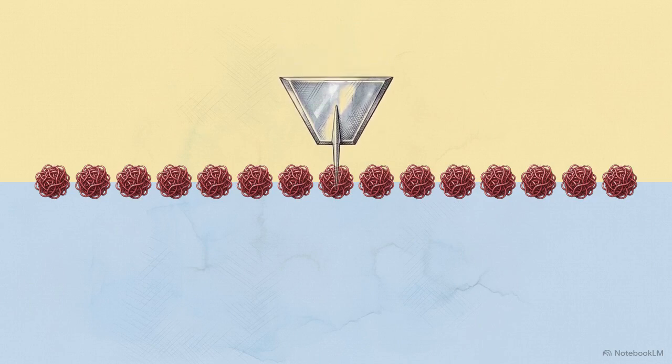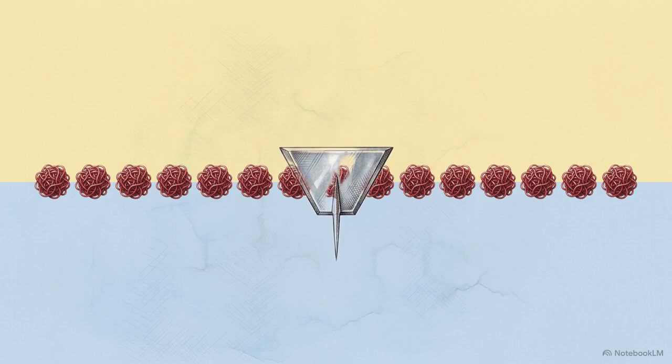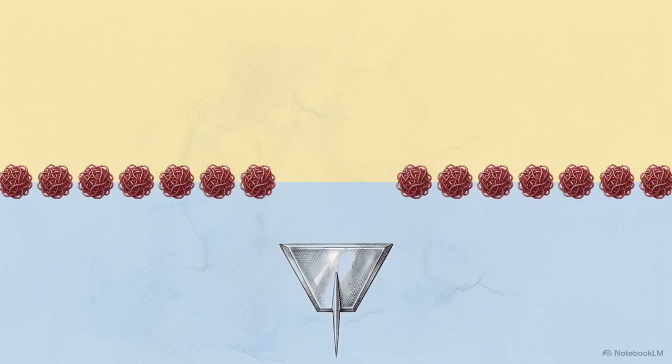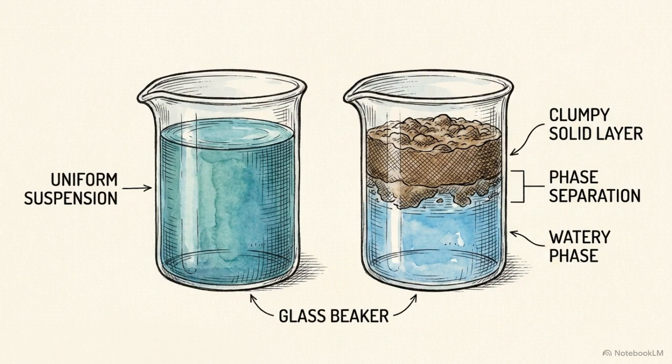The packing density of the protein layer actively resists the tip's downward pressure before yielding to a breakthrough force. Measuring the viscoelasticity of this specific boundary layer provides direct data on the bulk emulsion's ability to resist coalescence and separation over months of shelf life. Two formulations with identical bulk rheology profiles can behave differently over time because stability depends on specific nanoscale interfacial metrics.